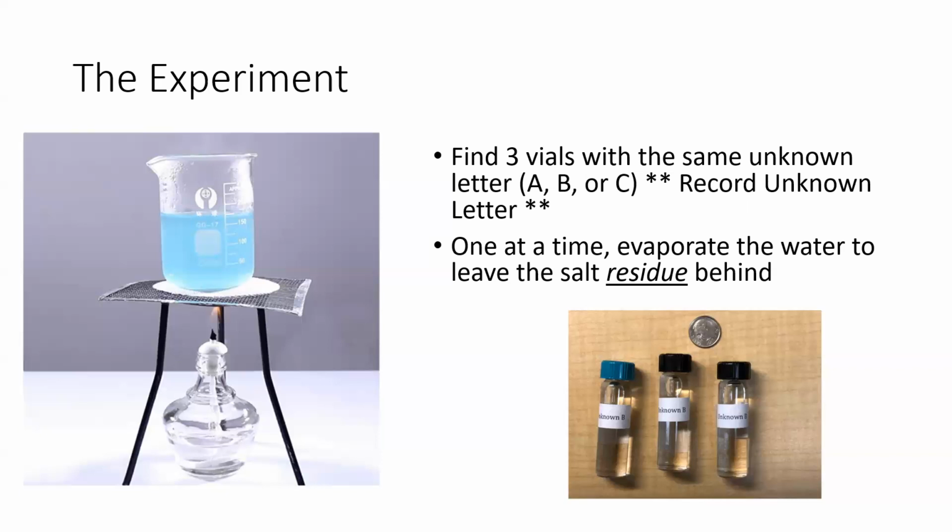The reason you're provided 3 vials is to do 3 individual trials. So you don't want to mix all 3 vials together and just do one evaporation.